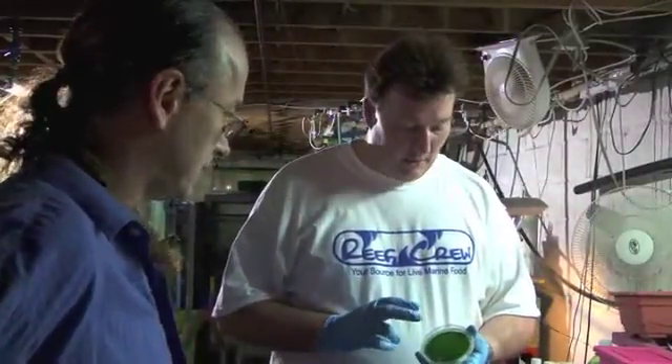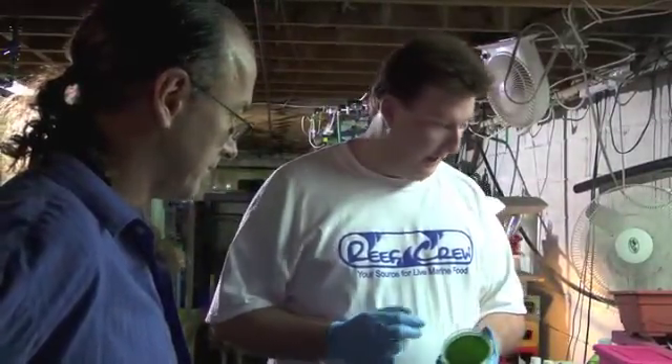Welcome. I'm going to demonstrate how to get the algae off the disc and then into a medium that we can use to start our culture.